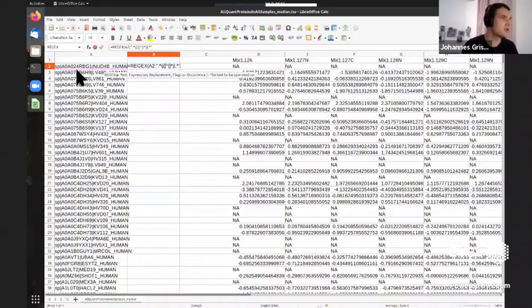But just to show you that this is really an issue, sorry, I just mistyped here. And now we replace this with everything that I extracted here. Okay, that was the wrong one. Let's see, we have to add 1 dash here. So now I double check this. This portion that was just extracted is actually the identifier between the 2 pipes.